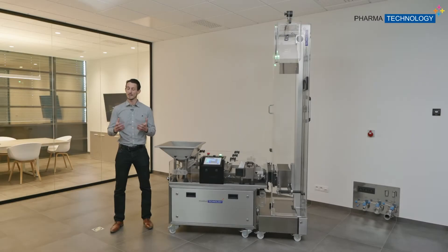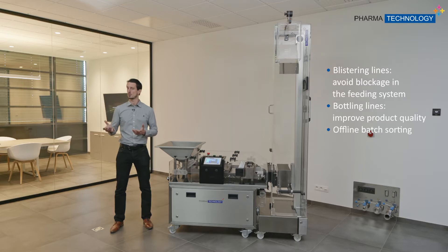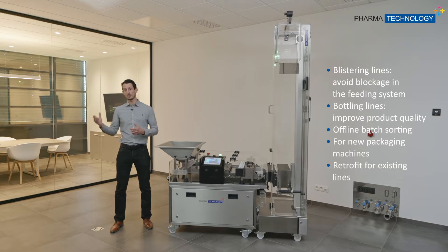The main purpose of the iSort is to improve general efficiency in packaging lines. You can use it for blistering lines in order to remove the problems of blockage in the feeding, or for bottling lines in order to improve general quality, but also for offline batch sorting. You can use it both for new lines to be integrated or as a retrofit for existing lines.